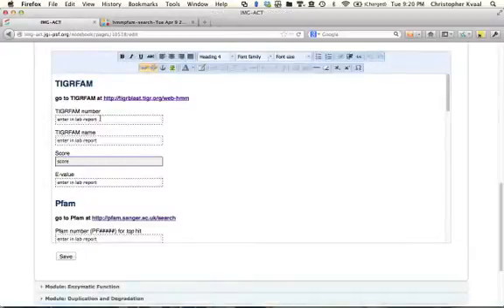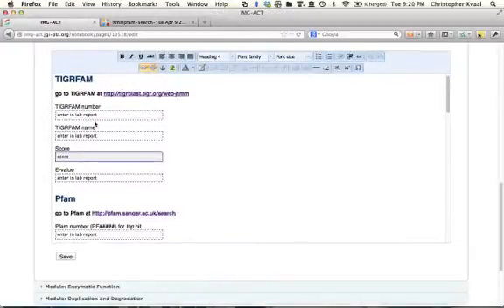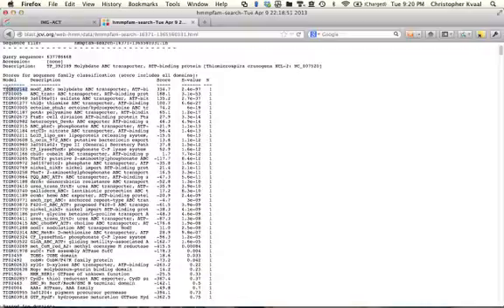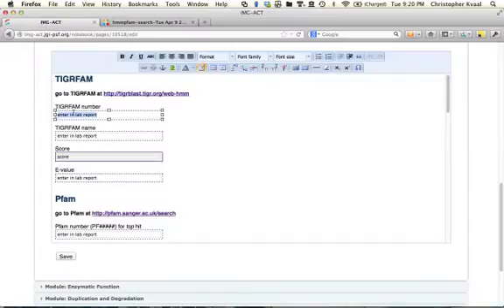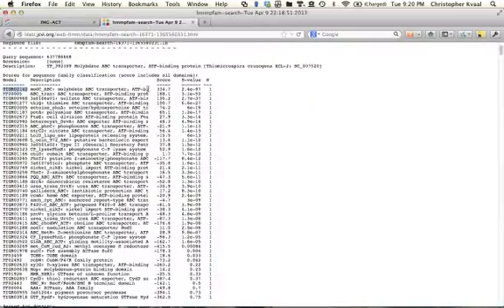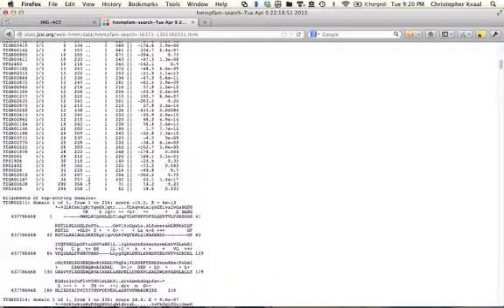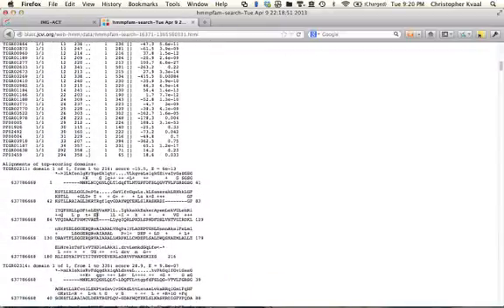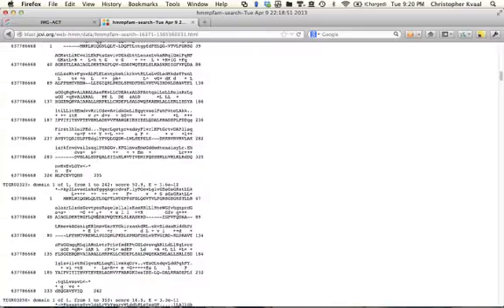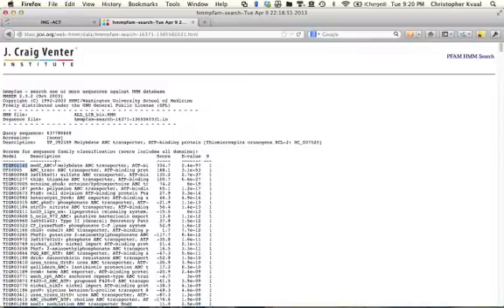We're going to be asked to put in the TigerFam number. That TigerFam number is right here, so we'll paste the TigerFam number in there. And what is the TigerFam name? It's cut off there, so I'm going to go down to the bottom to see if I can get more of it. I'm not getting more of it, so we'll just take this much of it.